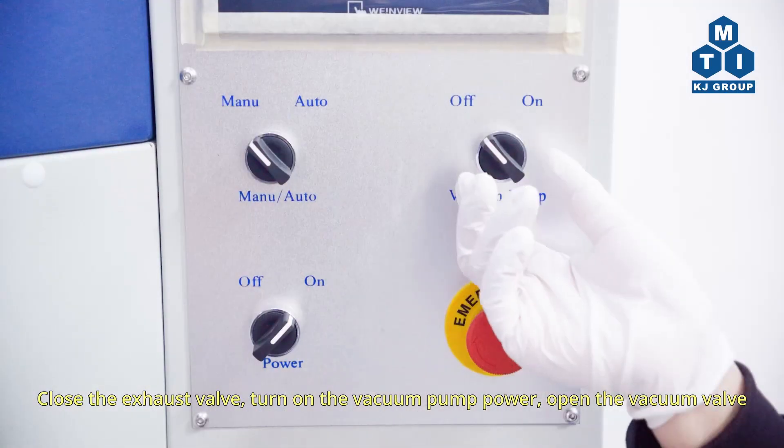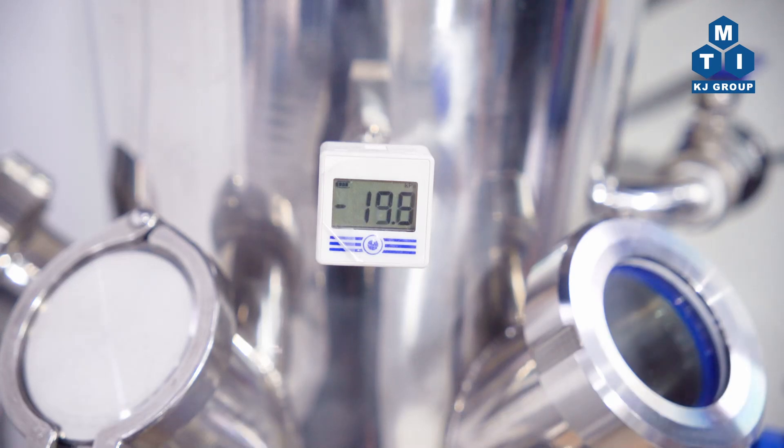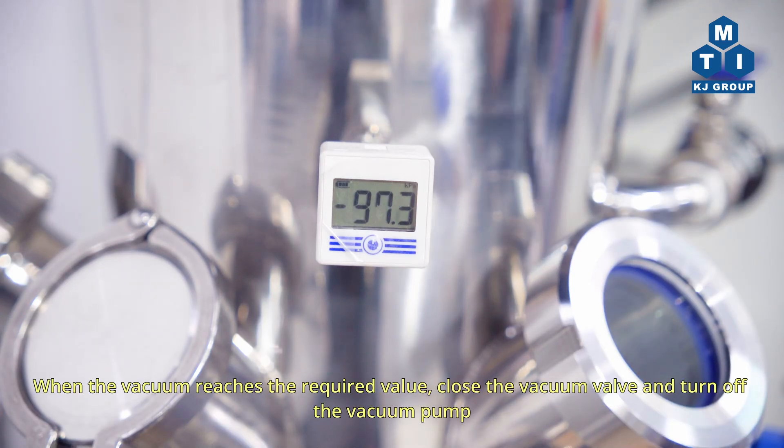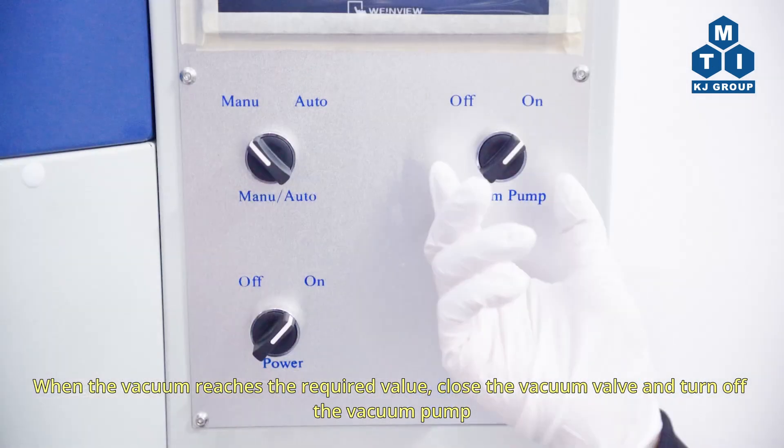Close the exhaust valve. Turn on the vacuum pump power and open the vacuum valve. When the vacuum reaches the required value, close the vacuum valve and turn off the vacuum pump.